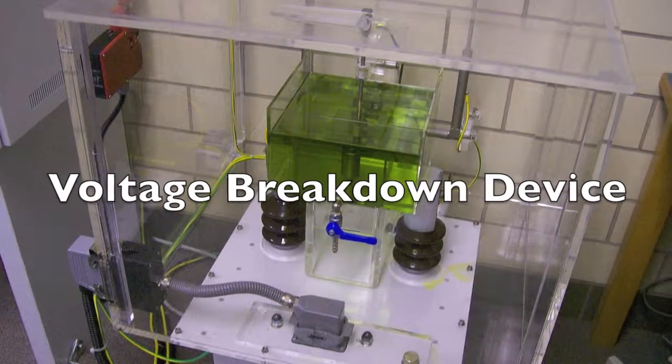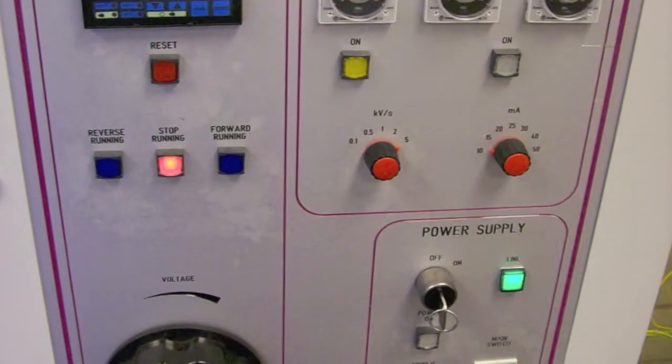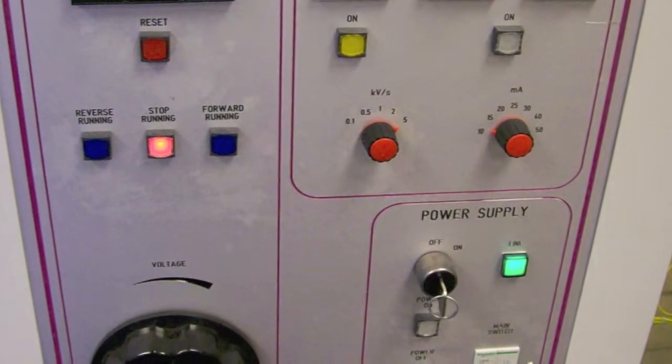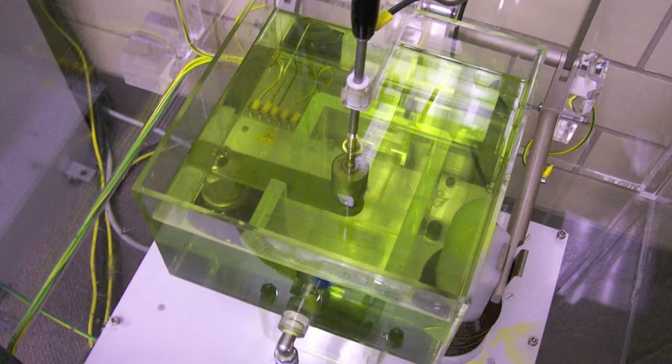The voltage breakdown or dielectric strength instrument measures the amount of voltage that can be applied across a dielectric sample before current flows freely.